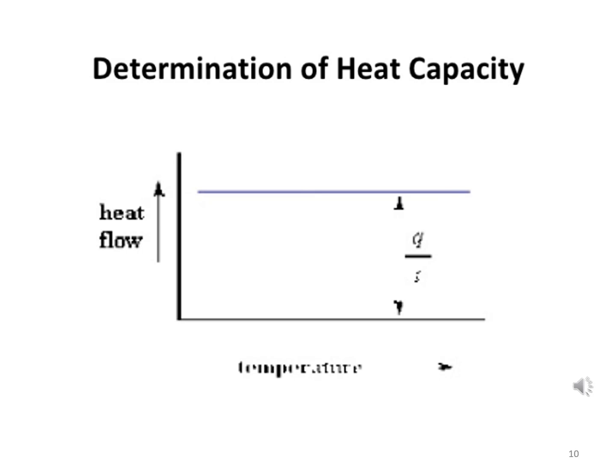The accuracy that we can get depends upon the instruments and the method we are using for determination of heat capacity or specific heat. Generally, if we talk about our practical routine, the traditional standard test methods provide a fairly rapid method for determination of Cp, and many manufacturers provide software specifically designed to comply with those methods.